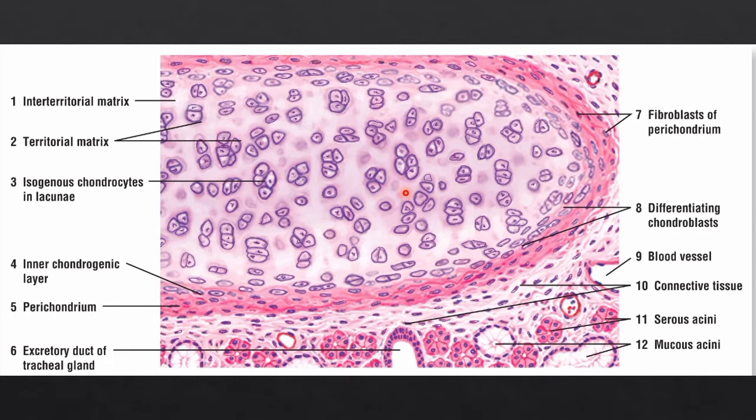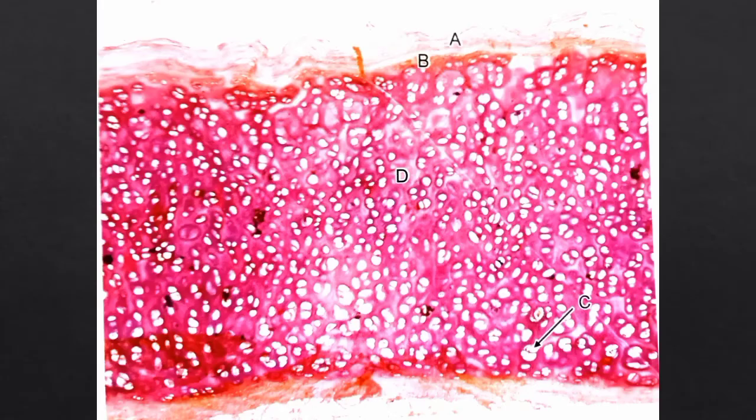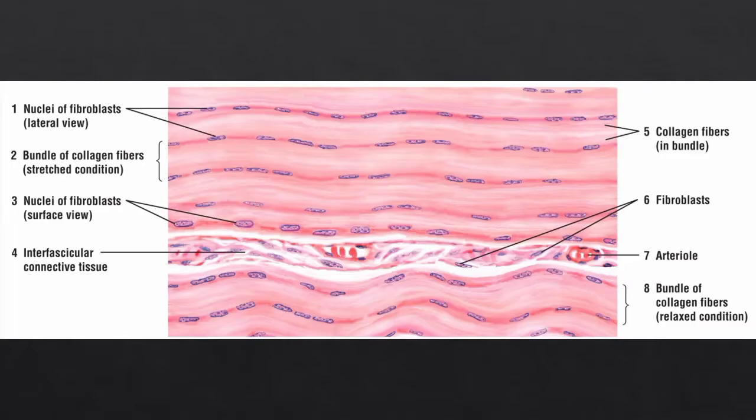So what you have to write in the second question: first you identify the slide as hyaline cartilage. The second identification points you have to write are the presence of chondrocytes in groups, and that a homogeneous basophilic matrix is seen. Like that you can write. Now we are moving to the next slide, and this is how we can identify it. Perhaps you may not see the basophilic matrix clearly, but you can identify the groups of chondrocytes called cell nests. That is the identification of hyaline cartilage.